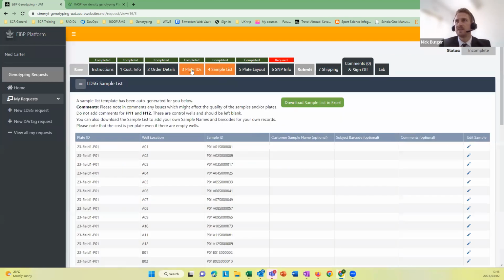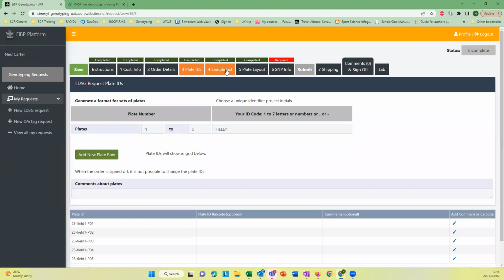Were there any specific steps or parts of this, Gabby, that you wanted to cover? Not really, because my connection was a bit down when you went through this particular step. Once you have downloaded that, do you have to fill it in automatically in the sheet, or can you fill the downloaded sheet and then upload it later? That's where it was not very clear for me. So you can download it.